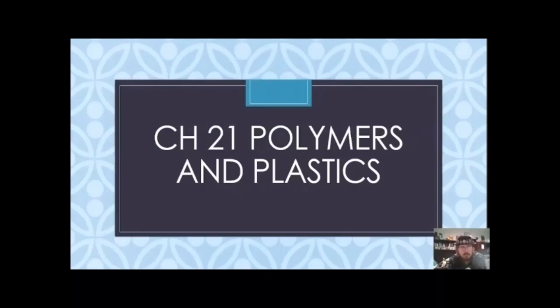Welcome, folks. We are now on to Chapter 21, Polymers and Plastics. If you're following along in the book, the demo they have is separating polymers based on their density. That's not really fun. How about we actually make some polymers? I'm going to take some liquid latex and show how to polymerize this rapidly into rubber.